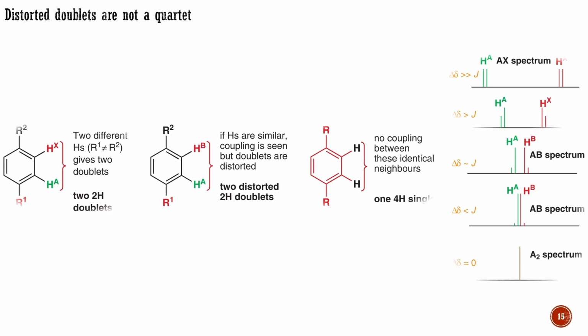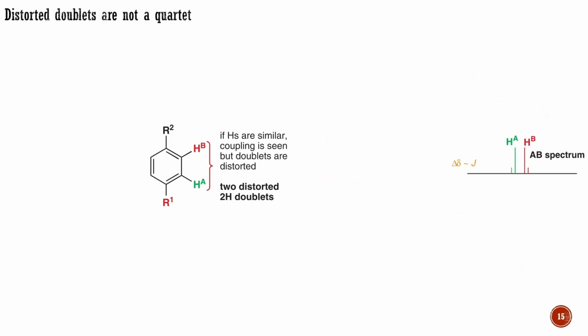Depending on the substituents in the benzene ring, the 2 inner lines in the signals may be closer than the gap between the doublets, or even the 4 lines may all be equally spaced. You may see this situation described as a quartet. In reality, it is not a quartet. A quartet has exactly equally spaced signals with intensities 1, 3, 3, 1, arising from coupling to 3 identical protons, and you should avoid this misleading usage for such systems.